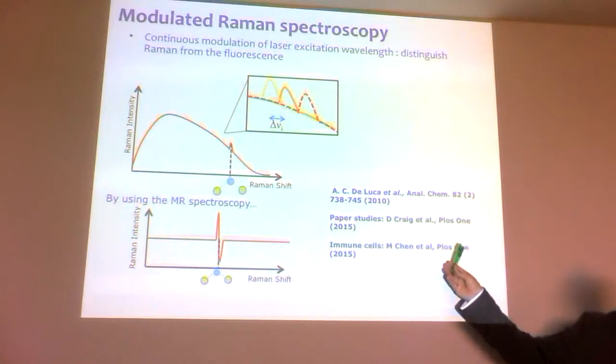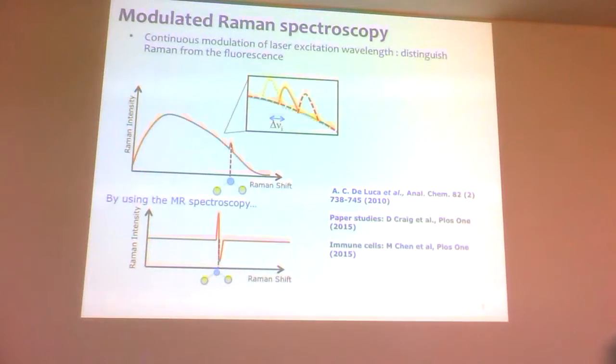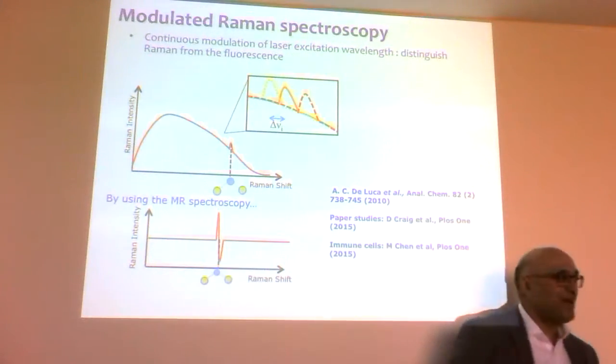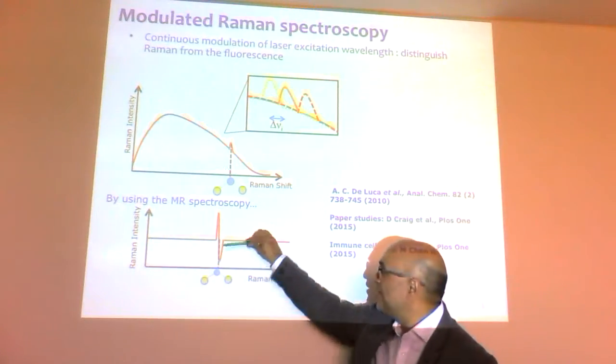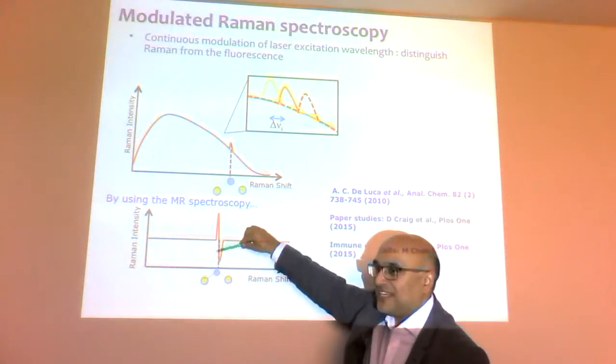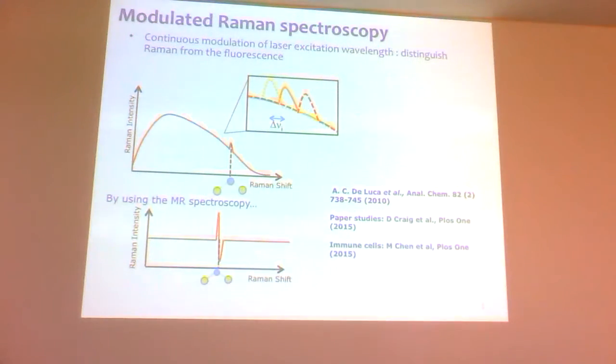We've actually done this on paper microfluidics. This is work on immune cells. And if you're in atomic spectroscopy, which I imagine virtually nobody here is, many of you will know this kind of idea is used for laser stabilization, because we would love a derivative signal. That kind of signal is very powerful in laser stabilization, where you need a derivative to lock to or stabilize a laser to. So in other words, if there's a shift in wavelength, you get a signal that's proportional to the displacement you have in laser wavelength from a locking point. And that's what you might see.